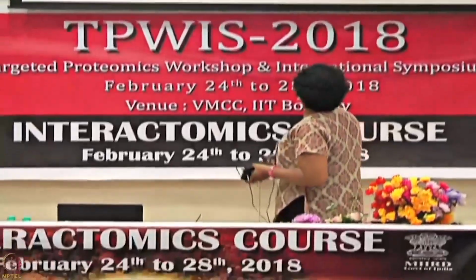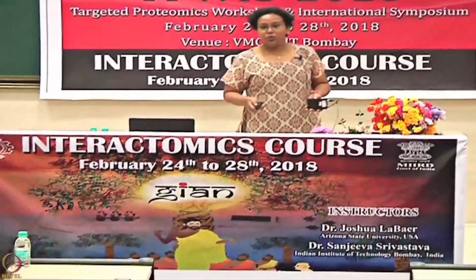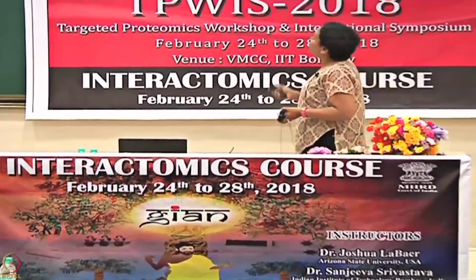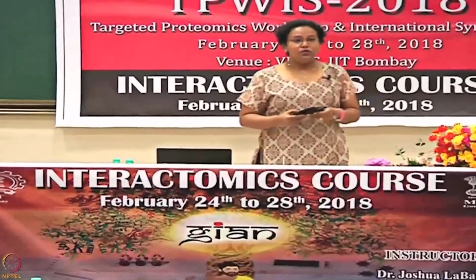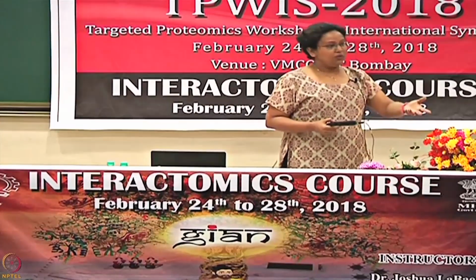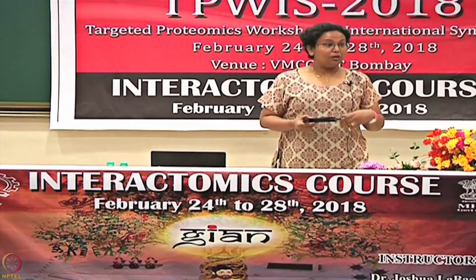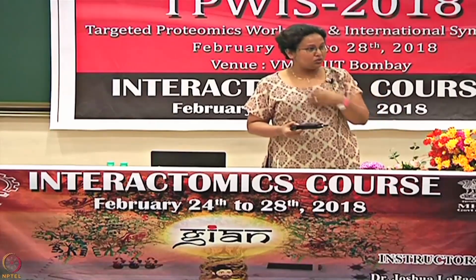Again, if your pH is higher than your pI, then there is no attraction because both of them become negative. So that is what we call pre-concentration also. When we are doing a ligand immobilization and sometimes we see that we are not attaining the amount of RU that we are expecting, this is something extremely important, apart from the chip quality and EDC quality and things like that. So this is also something very important to keep in mind.